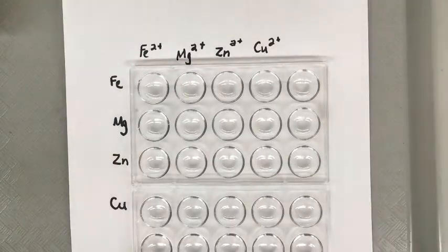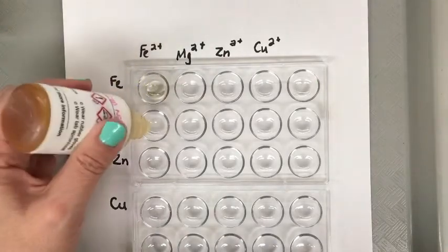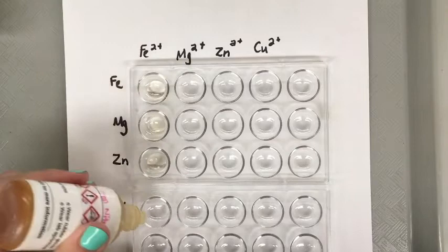First off we'll prepare our solution. In the first column I'm going to put some solution of iron ions. We'll put a few drops in each one.